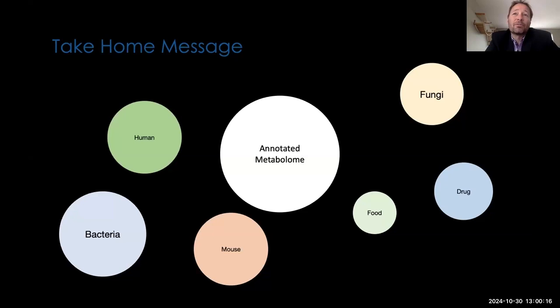One of those is reaching out to different people in different communities so that we can get those samples and run them. The other one is to collaborate with people who have an interest in food analysis, and work with them so that they also collect data on those so that we can really expand the reference library of food. I think this is one of the necessities.